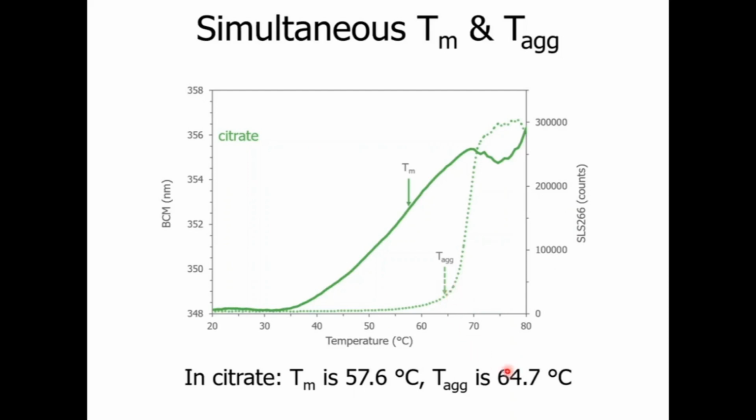In this example, this is 64.7 degrees. Is there anything we can do to optimize the stability of this ADC? Is there anything we can do to push these parameters higher?